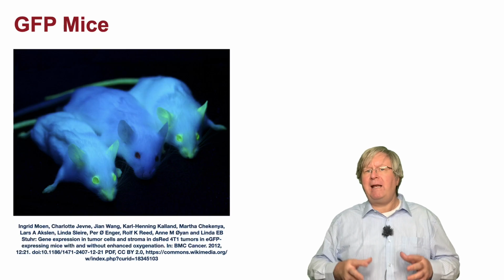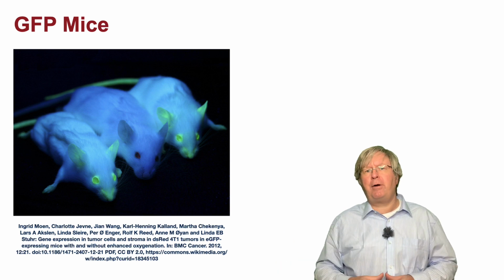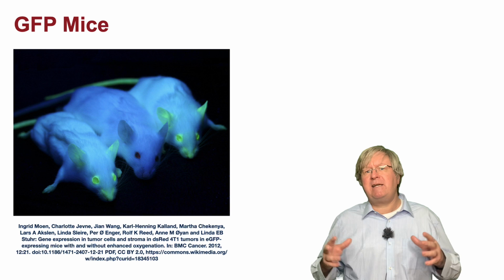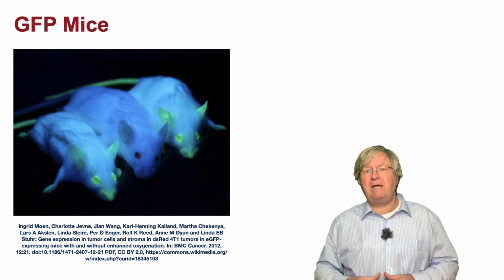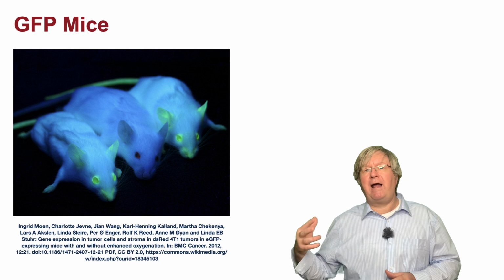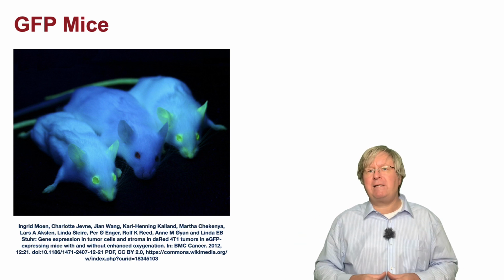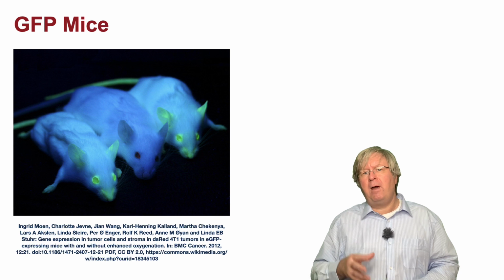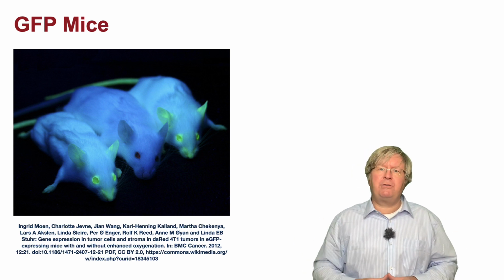And while GFP labeled proteins have nothing to do with protein production and purification, it is worth mentioning here as it is a technique that, like GST and His tag proteins, relies on the cloning of a marker and the protein of interest into a plasmid so both are expressed as a single protein molecule. Okay, so that covers all I want to say on labelling.